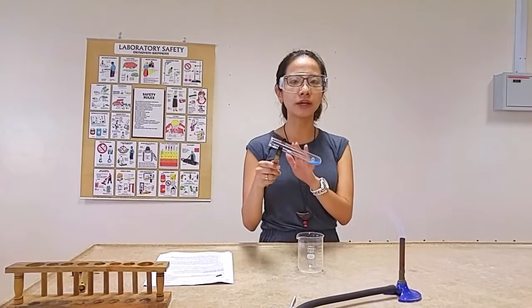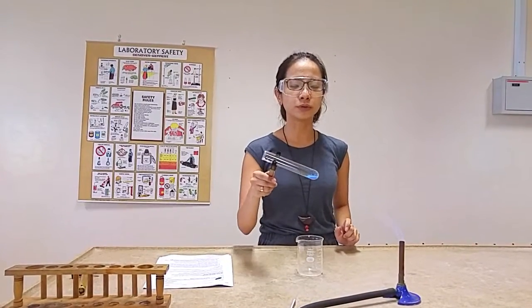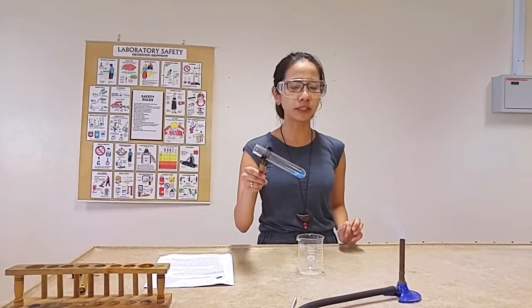So first, add in 2.5 to 2.7 grams of copper sulfate into the boiling tube.